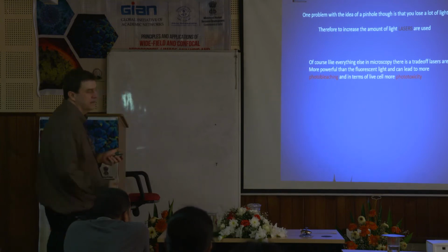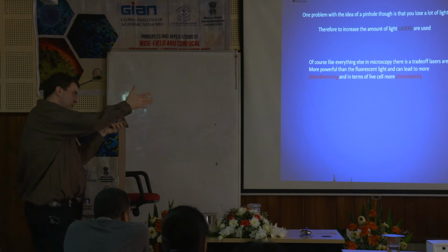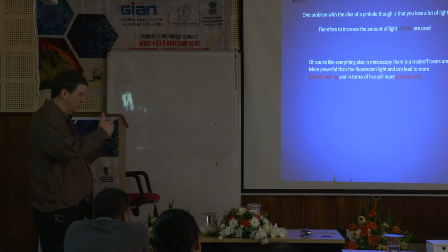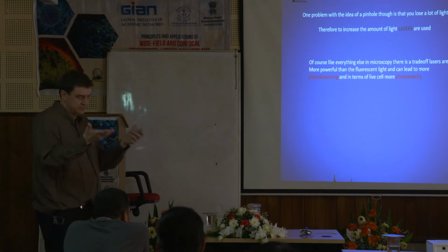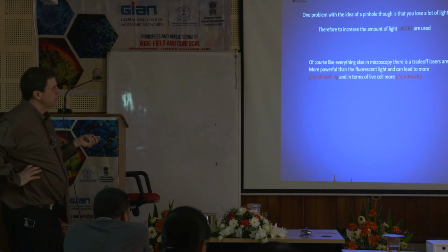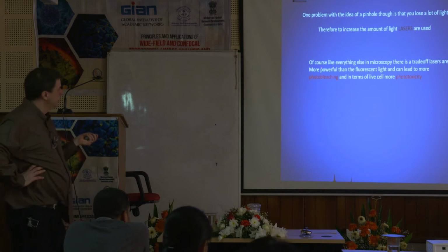Okay, but like we've talked about, if you do one thing good, then one thing bad happens. It's always a trade-off here. Good and bad always sort of go hand in hand. So lasers are much more powerful than the other light. So the problem here is it can lead to photo bleaching.